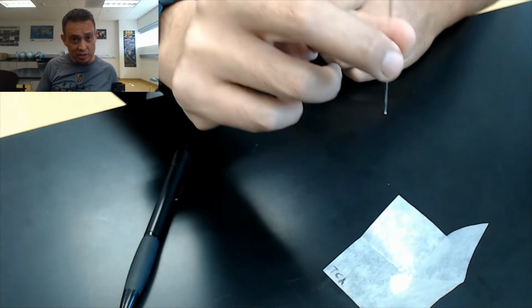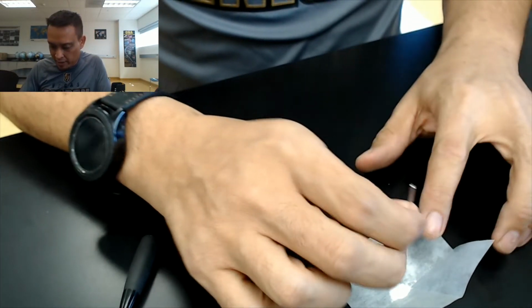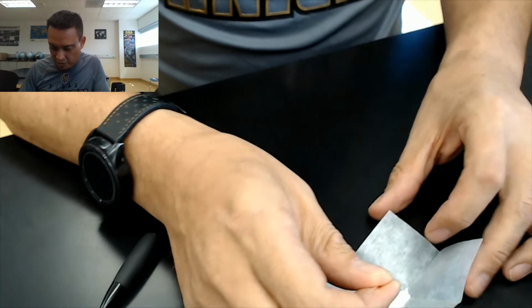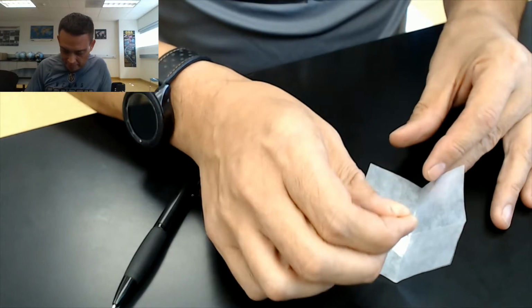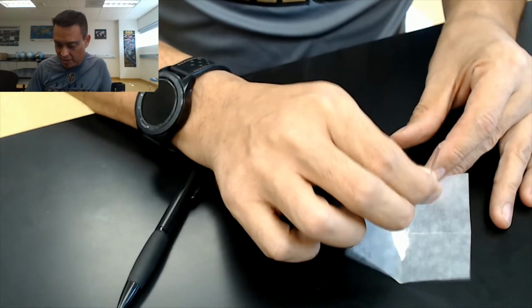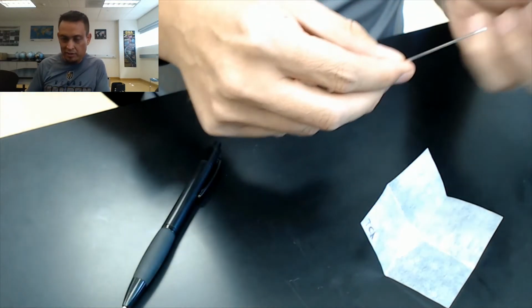And then all you do is you simply just tap into the solid. So I like to bunch the solid into a little pile here, and then you kind of just tap it into it. And you may have to readjust your pile every once in a while as needed. So here, just tapping it into there. I like to go to about a half centimeter to a full centimeter in height inside of the tube. And yeah, this is probably enough right here.